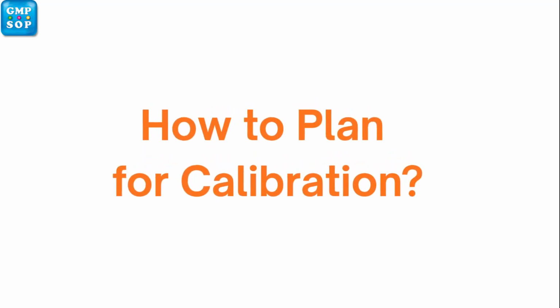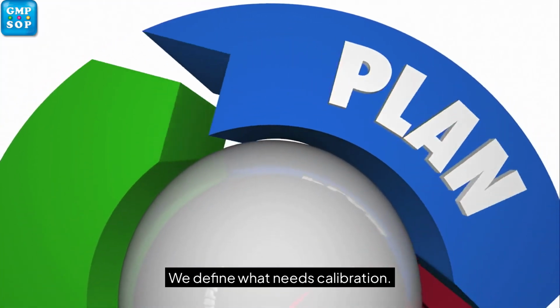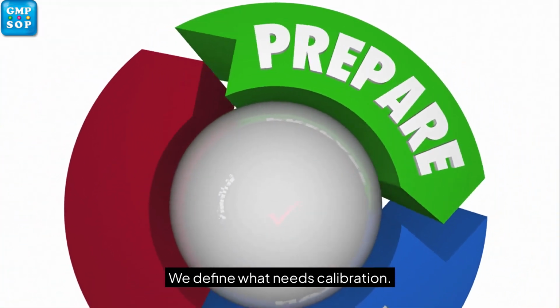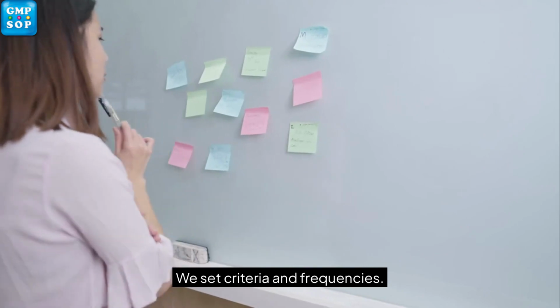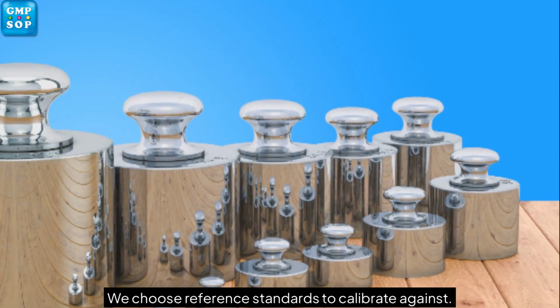How to plan for calibration? A calibration procedure starts with planning. We define what needs calibration. We set criteria and frequencies. We choose reference standards to calibrate against.